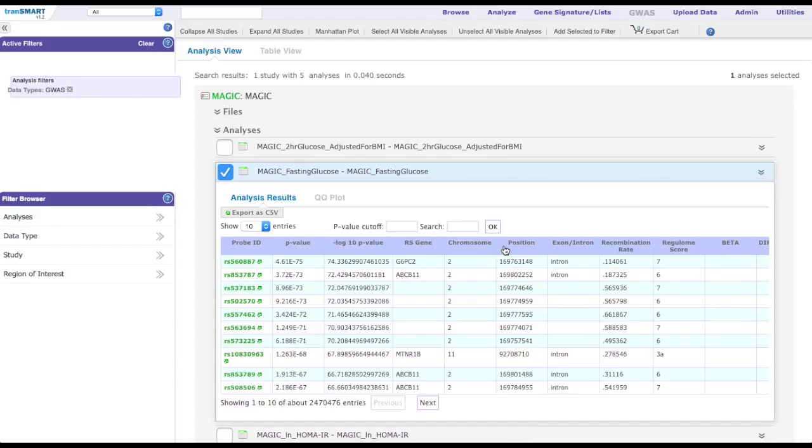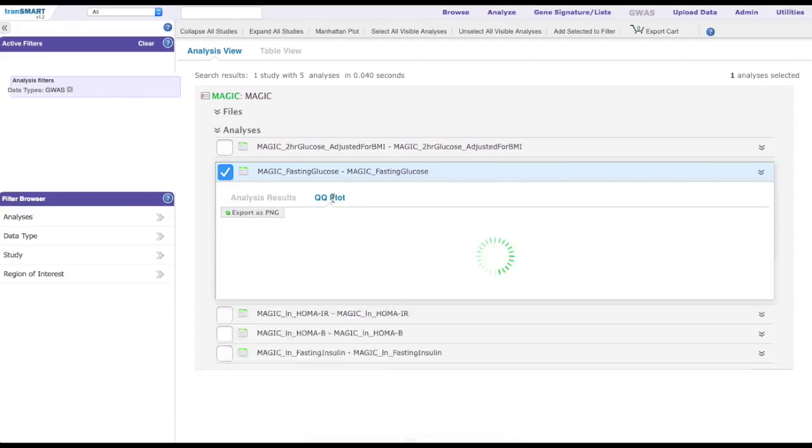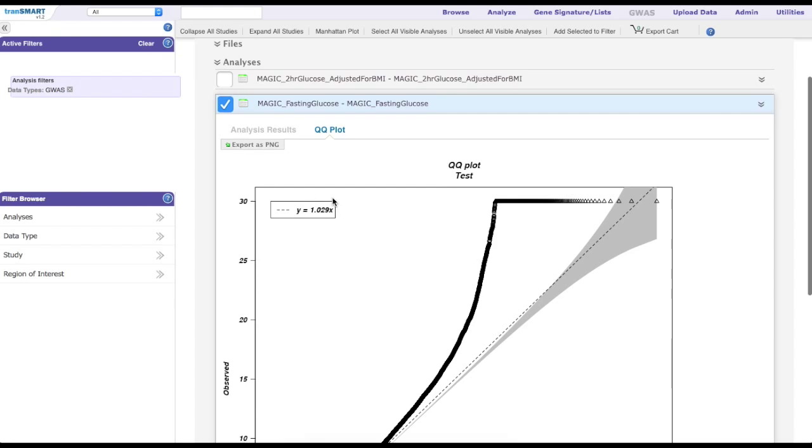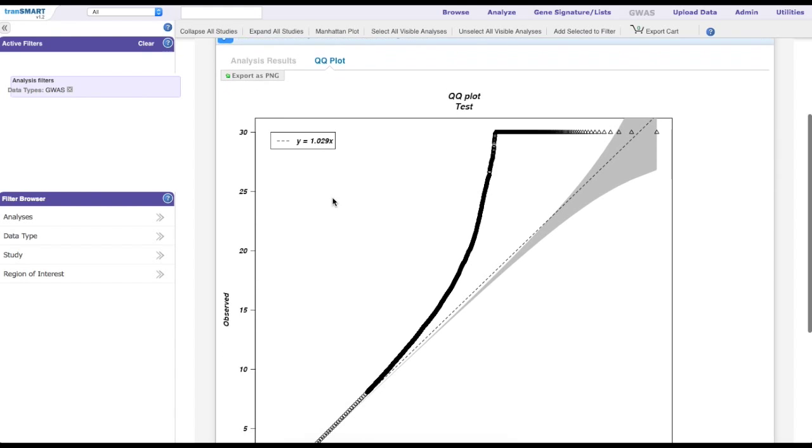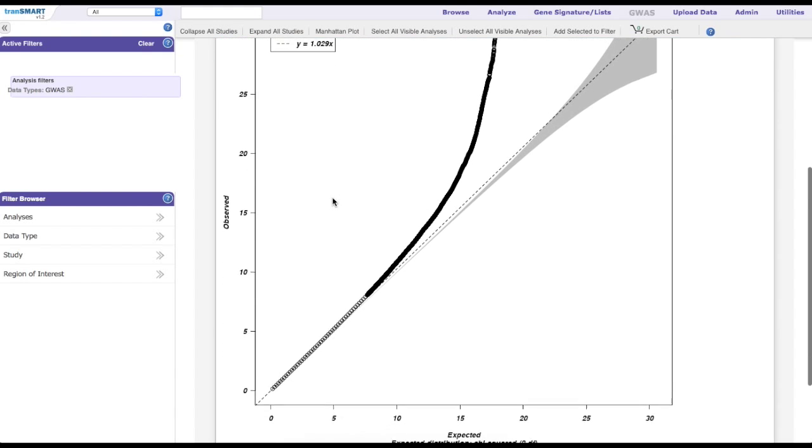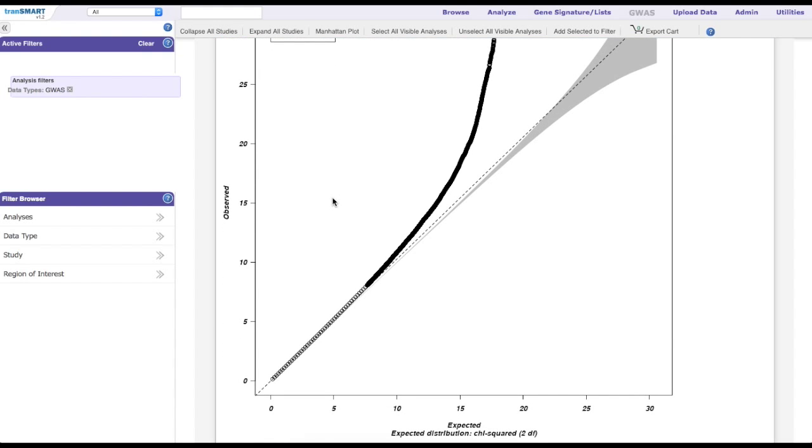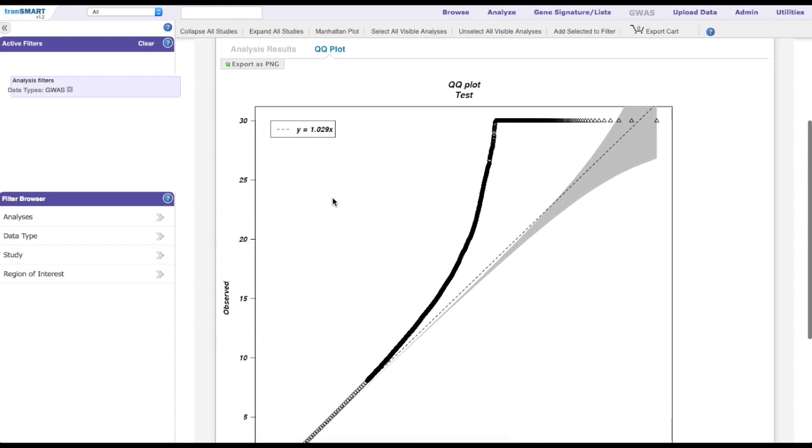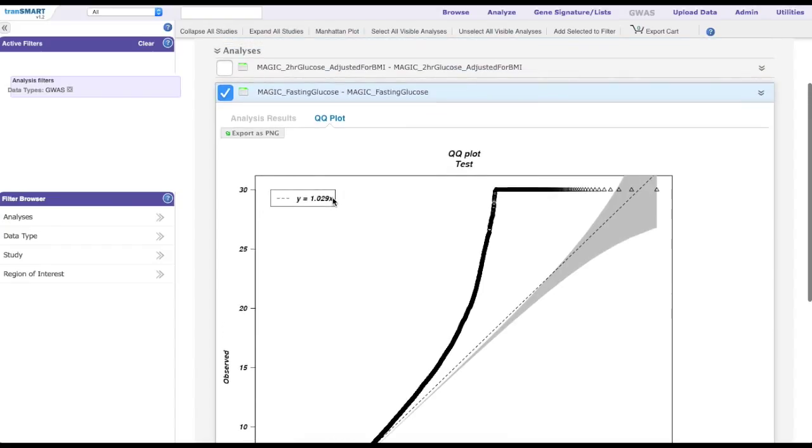This view can be easily exported by clicking on the Export a CSV button at the top of the table. Clicking on the QQ plot tab will present a quantile-quantile plot of the observed versus expected distribution. This view can also be exported by clicking on the Export as PNG button above the image.